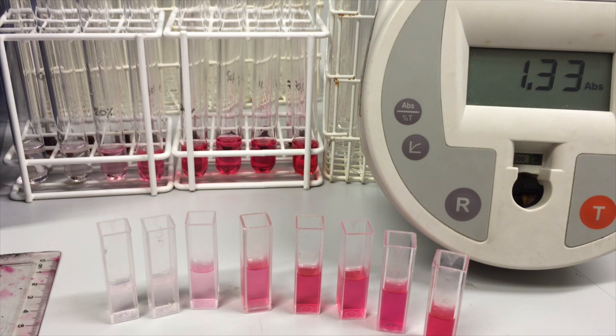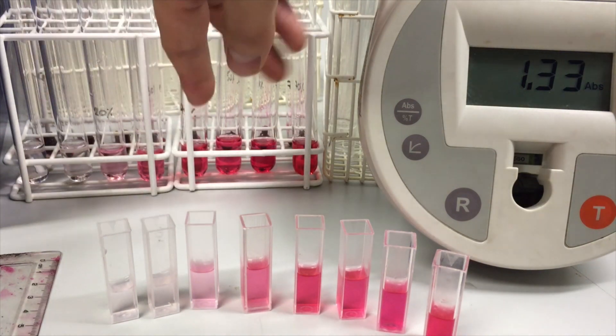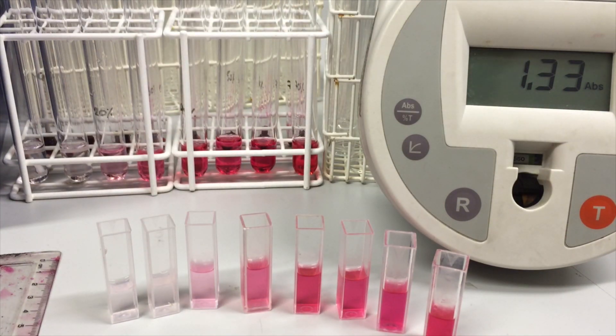And I guess improvements we could have made would possibly be to have repeats of each concentration so instead of just having a single tube at each concentration have three perhaps four or five tubes at each concentration so we get we can average the readings instead of just having one absorbance reading for each concentration. That would have allowed us to identify any anomalies that would happen. In this case we only had one repeat so we don't know if any of these results were anomalous or not. So that's another improvement we could have made but that would make it more reliable.